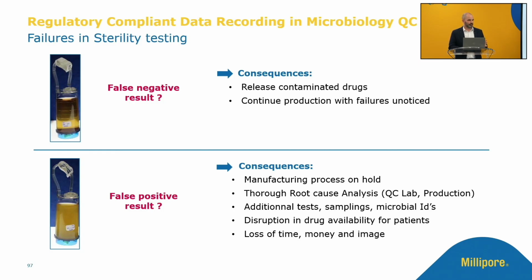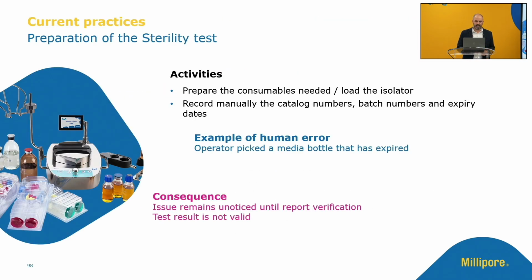So I will just do a small presentation, and then afterwards Nicolas will make a short demo of mTrace with a typical SOP that we prepared. Just before, I wanted to highlight some typical examples from real cases of failures or small mistakes that could happen during a sterility test. We are all humans. It can happen one day or another that something goes wrong, also because we do things out of habit. And as I said, when working in isolators, it's really difficult to work with written procedures. So people usually work with the test in their mind and not really following exactly the written guidance.